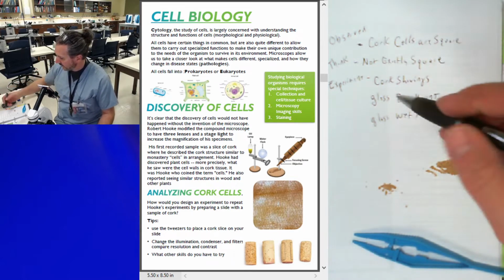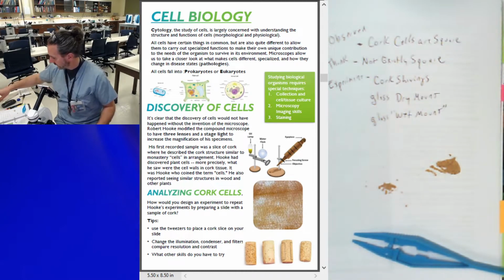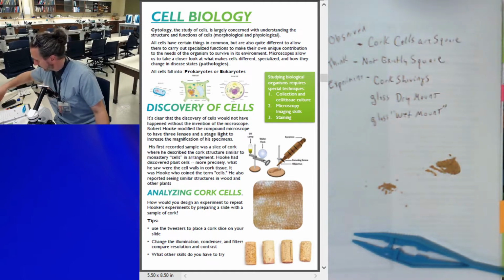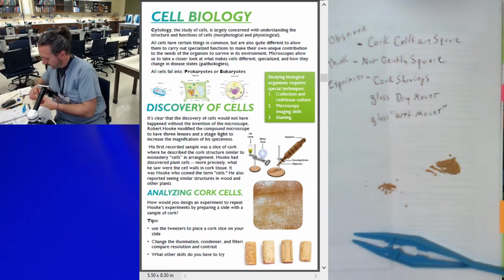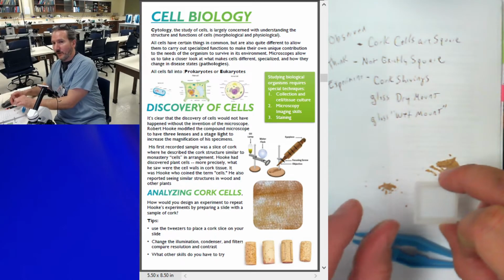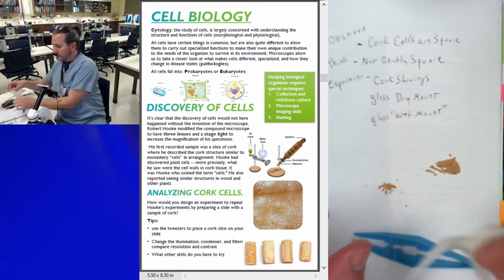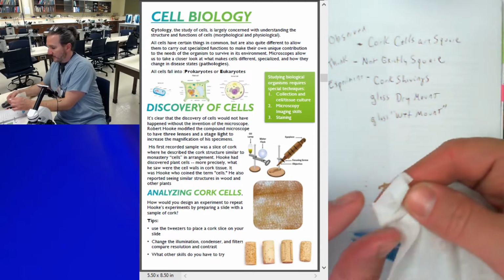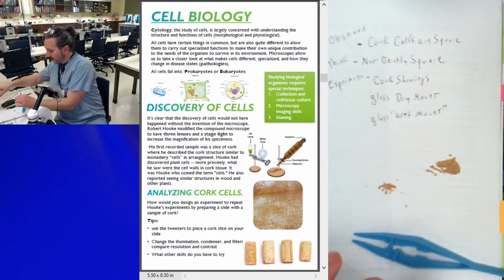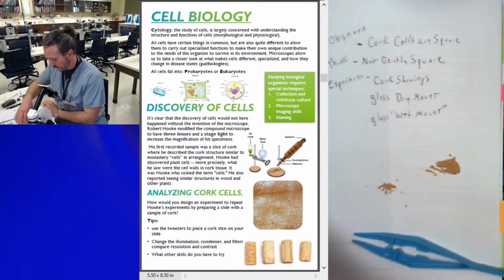Okay. So our wet mount and dry mount. I'll take my glass slide. Oops, which I just had. There's my cover slip. Don't forget, when you take the cover slips apart, hold them by the edge. Be very careful. I'm actually going to wipe off my cover slip. Go in the same direction. If I see some fingerprints or something, I might clean it with some Windex.